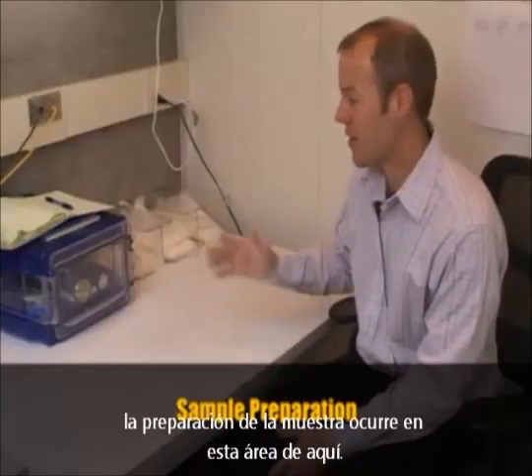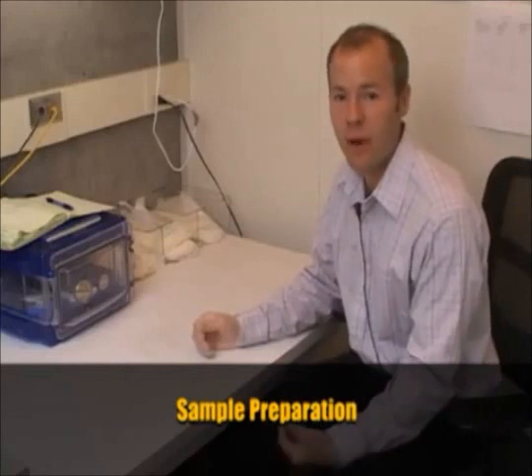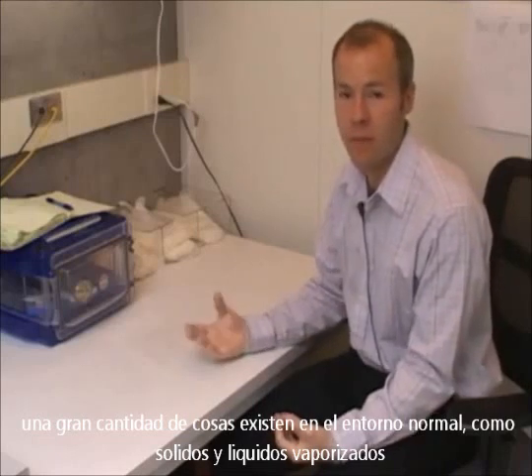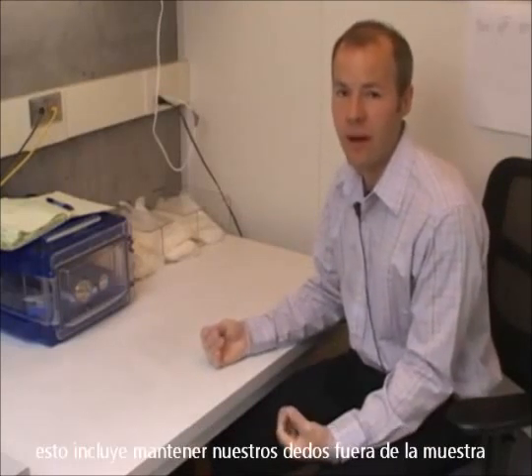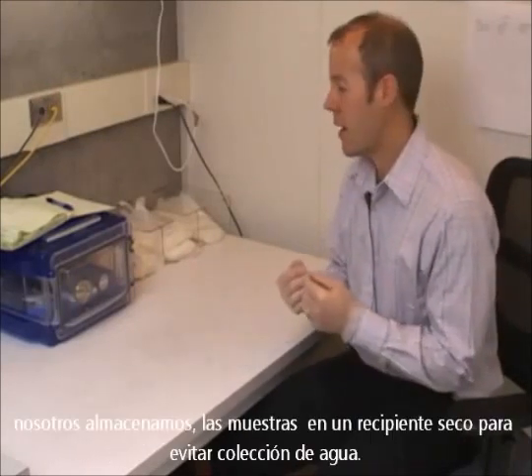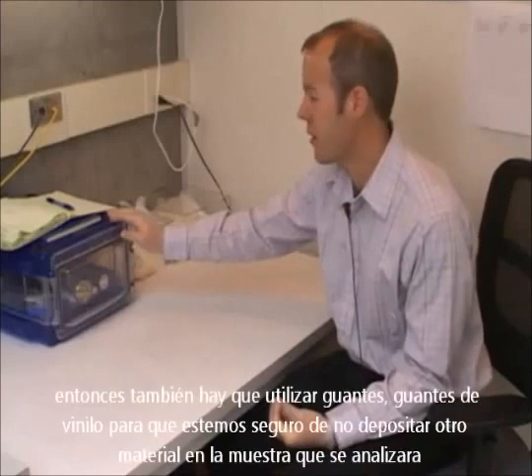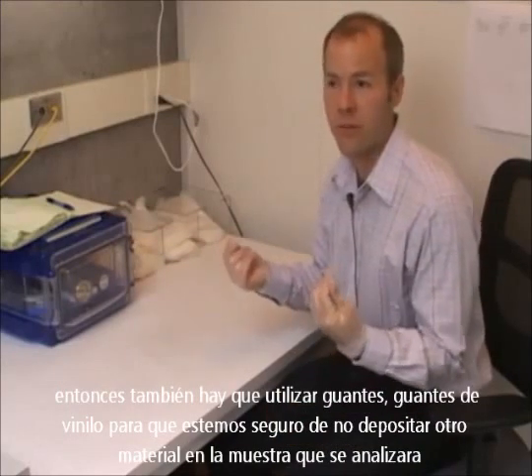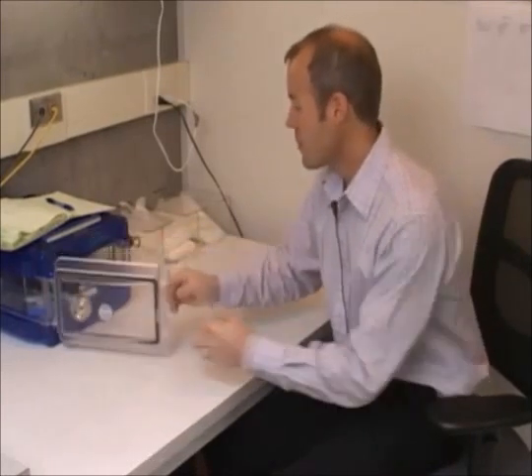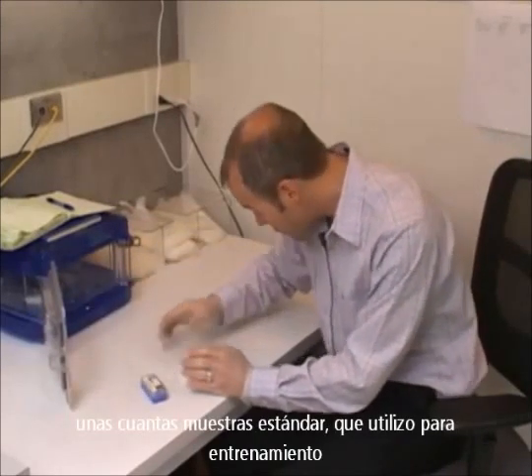The sample preparation happens in this area here. Because we're putting a sample into a high vacuum environment — 10 to the minus 5 millibar — a lot of things that exist in the normal environment as liquids or solids can be vaporized. So we want to keep the sample as clean as possible, which includes keeping our finger oils off of it and also any condensation from the air. We store the samples in a desiccator box to avoid collection of water on them, and we also glove up with vinyl gloves to make sure we don't deposit any material on the sample.